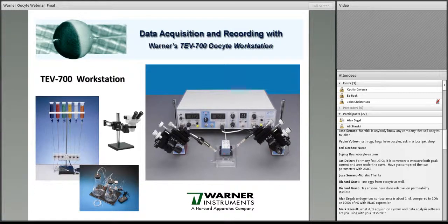The black pole is actually good for certain applications. For instance, for patch voltage clamp fluorometry, it is good to image the black part of the oocyte because it usually has less background. I see.